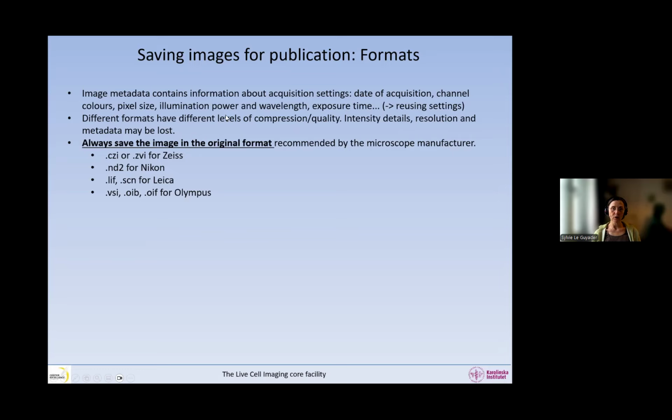So what is the original format? We have seen today that some people are using a Leica microscope and are saving in TIFF. Yes, you can acquire an image on the Leica microscope and say save as TIFF. So the TIFF format is available on the Leica microscope, but this is not the format that is recommended by the manufacturer.